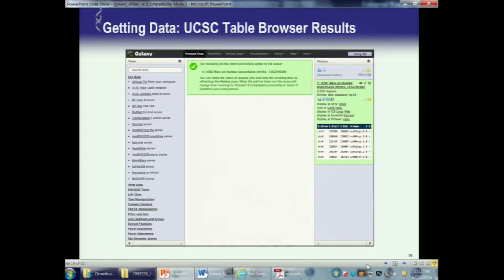There's actually a lot less genes on the X than that. There's more like 1,000. Many genes have multiple alternative isoforms, so that's why you may be surprised to see, why are there 3,000 genes listed on the X? There's not. It's just each one has its separate entry as a different isoform.